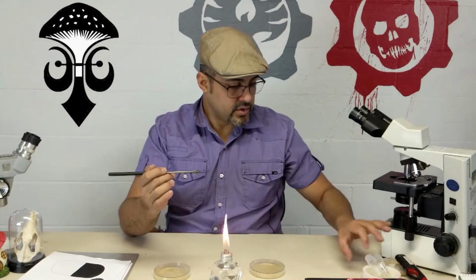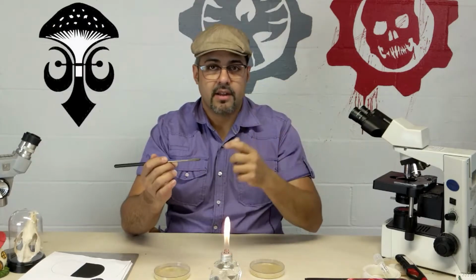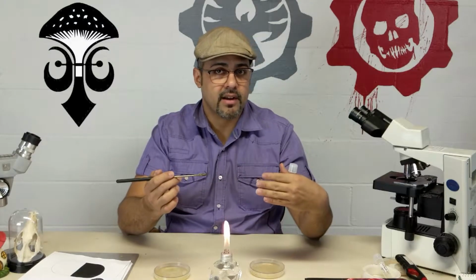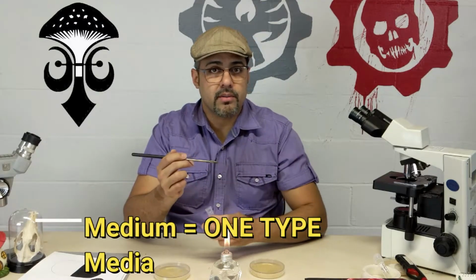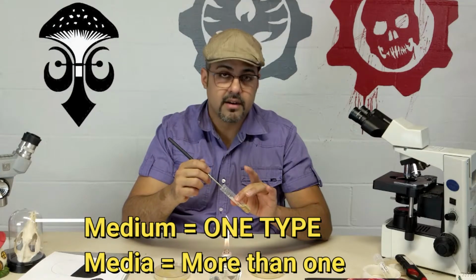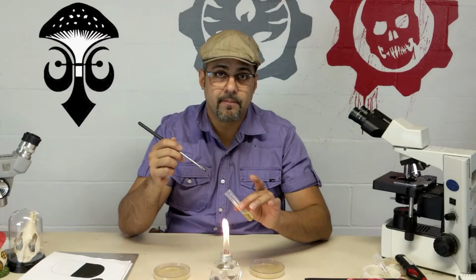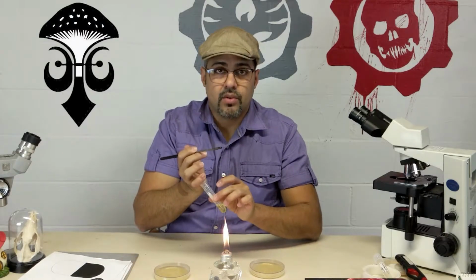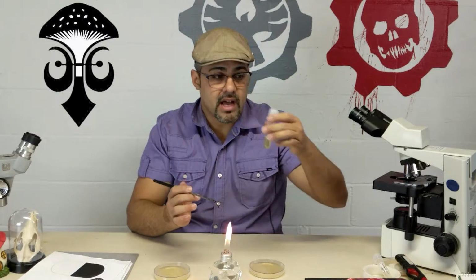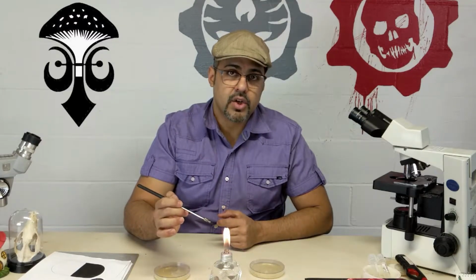If you're transferring to a tube, let's say that this is a sterile tube with medium, then the same thing. You have the bacteria in there. You have to do this quick. So you open it with your pinky, flame 2 or 3 times. Your bacteria is here. Mix it in there because you want the bacteria to be mixed in that broth. After that, you flame, cap it, and after you cap it, rack. And after that, you flame your loop.